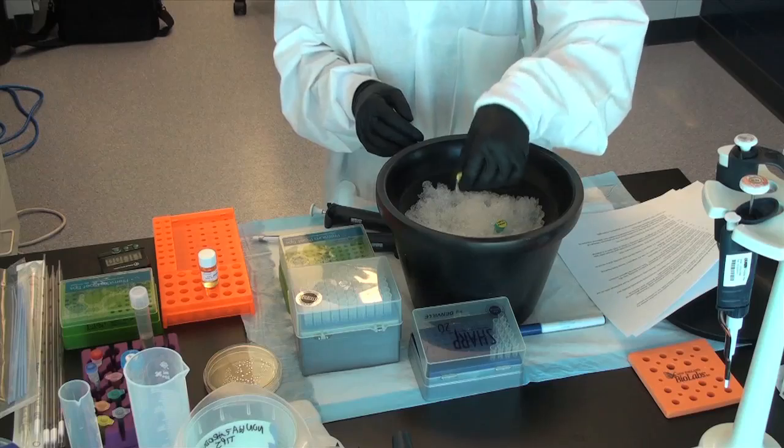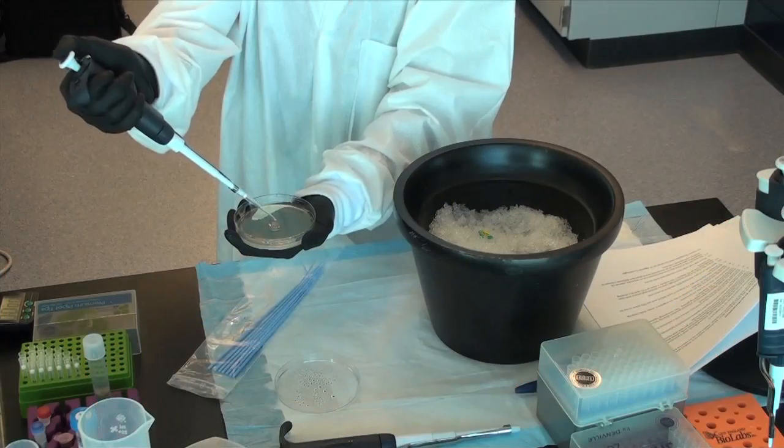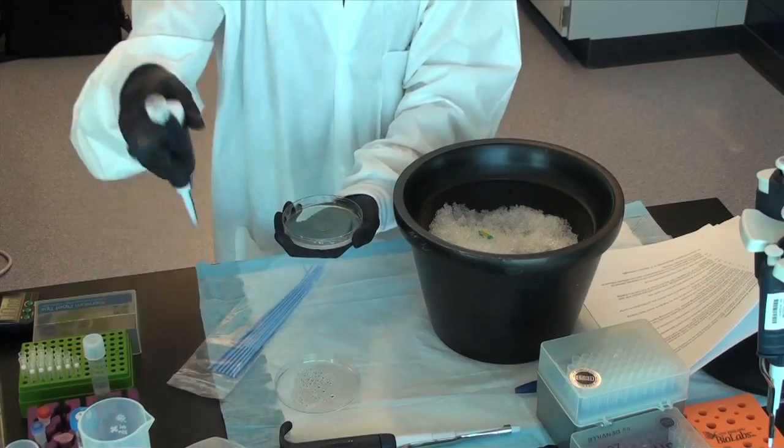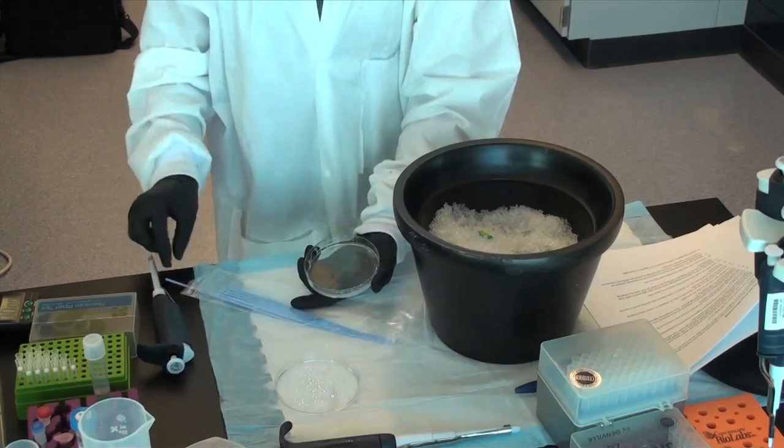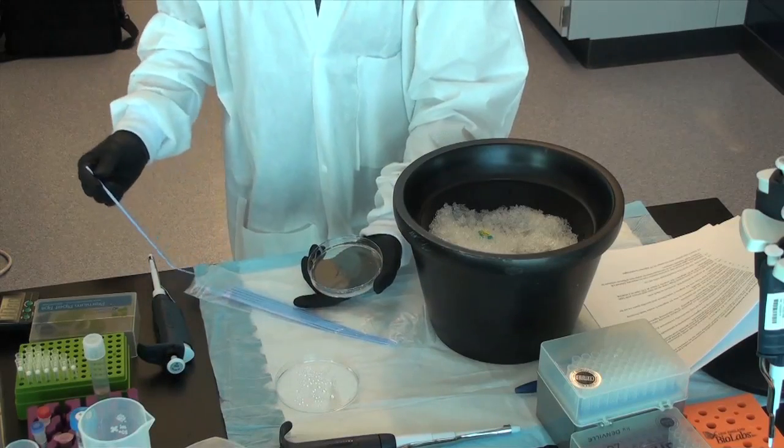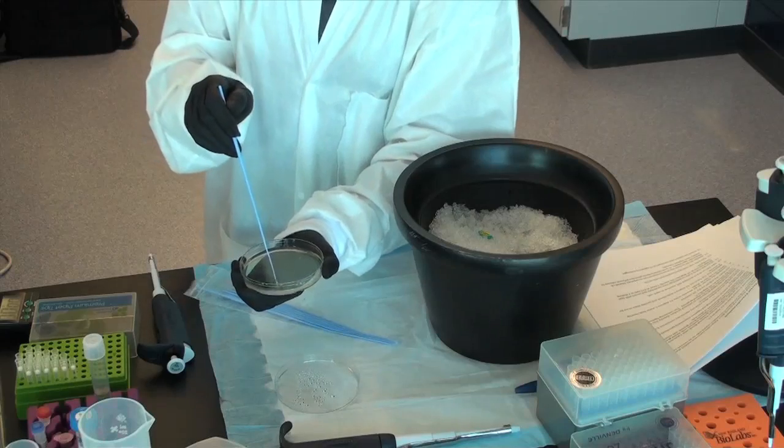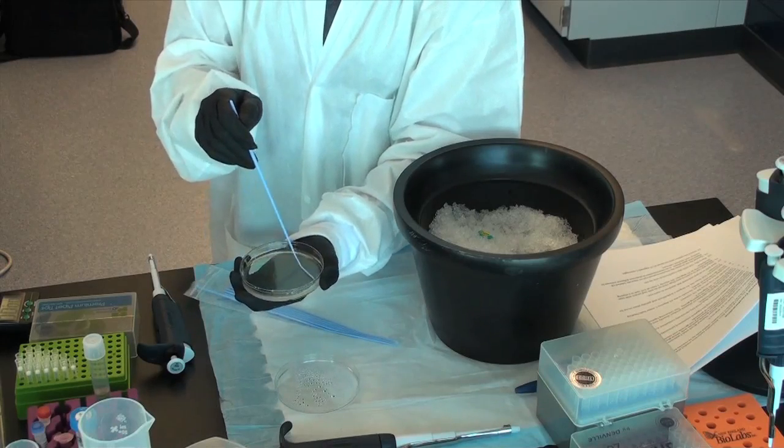Step 12: Place the vial with the transformed cells on ice. Step 13: Spread 10 to 50 microliters from the transformation vial on separate labeled LB ampicillin agar plates. It's recommended to plate two different volumes to ensure well-spaced colonies.